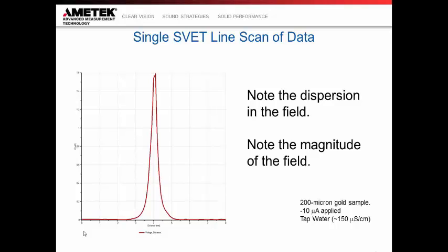The units on the distance axis down there are from 0 to 8 millimeters. And so where do we start seeing the response of the field? Now, an analytical chemist is going to tell you that you're going to start seeing it three sigmas, or 3 standard deviations, away from the background. If I just look at this, I could say that I definitely start seeing a non-background response at the 3 millimeter mark. And then I continue to see a non-background response until I get over to a 5 millimeter mark. So that's about a 2 millimeter response of the field.